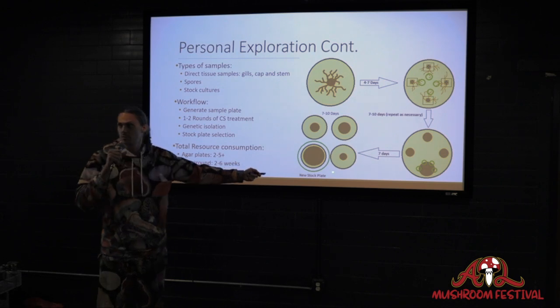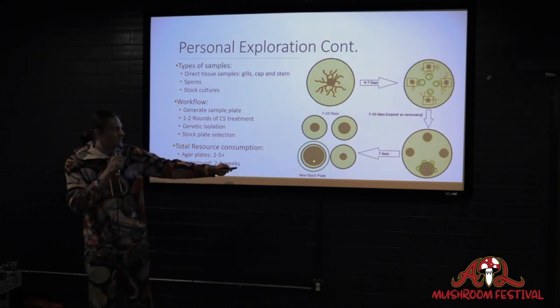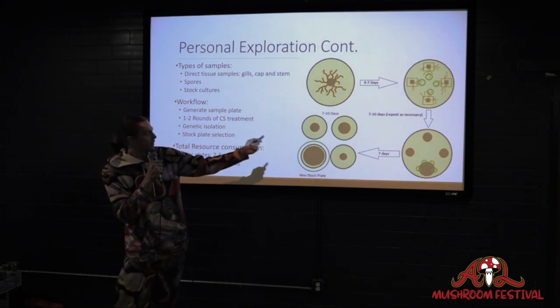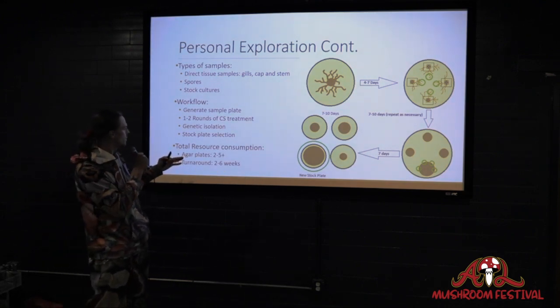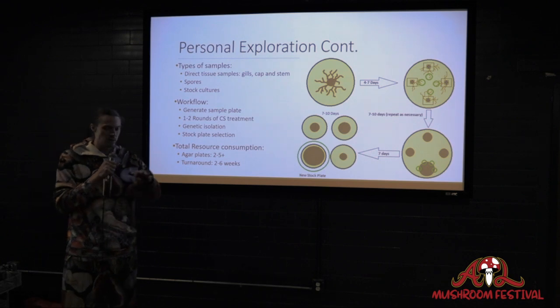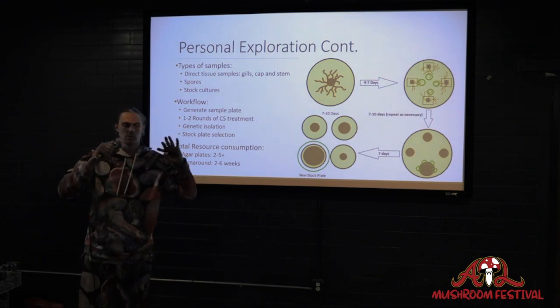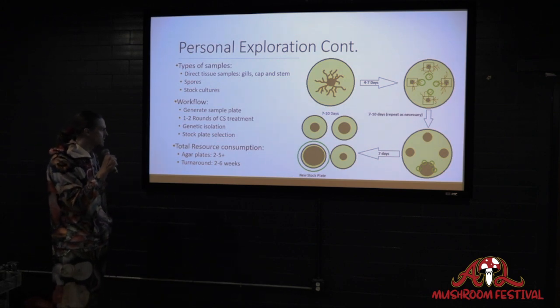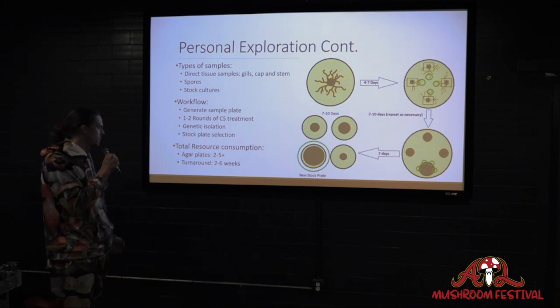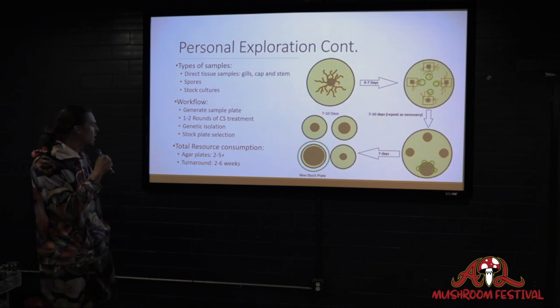And this is highly likely monoclonal, as opposed to here, here, or here. And so that's how I'm able to generate clean, healthy cultures using this technique without any sort of antibiotics, without any sort of fanciness. And I can do this entire process in as few as 2 plates, as many as 5. I mean, as many as you really want.